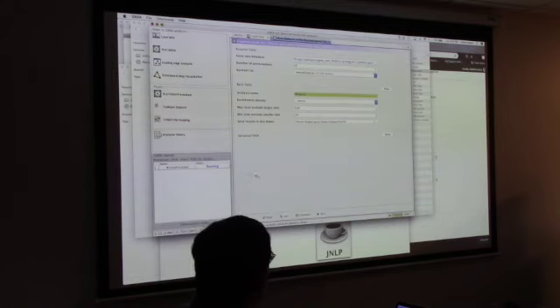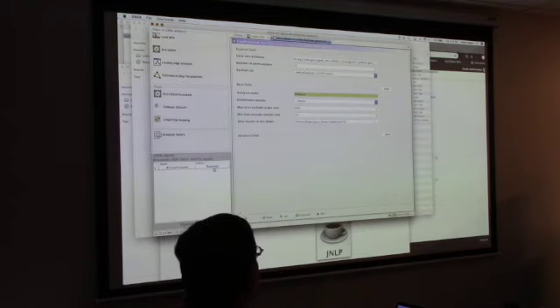And pretty soon it will tell you whether it failed or ran. Sometimes it fails because you missed something or some parameter is wrong, in which case, instead of showing success here, it shows error, and then you can click that and figure out what the error is. Normally it should run. Okay, so I'm going to let it run.